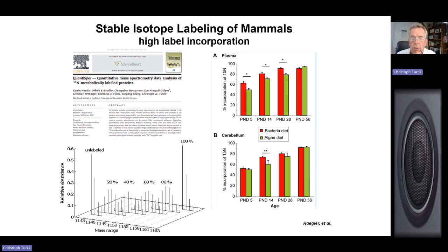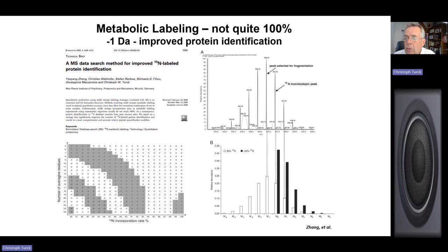And this was very important for us, of course, to have this software available in order for us to ascertain that at postnatal day 56, we're dealing with material which is over 90% labeled. So a very efficient way of doing this with the Silantes diet worked out very well. One thing, though, that we realized, and everybody else realized too, of course, is you never get 100% label. Maybe if you do many, many generations, you can approach 100%, but you're probably never going to get rid of some unlabeled or 14N isotope.